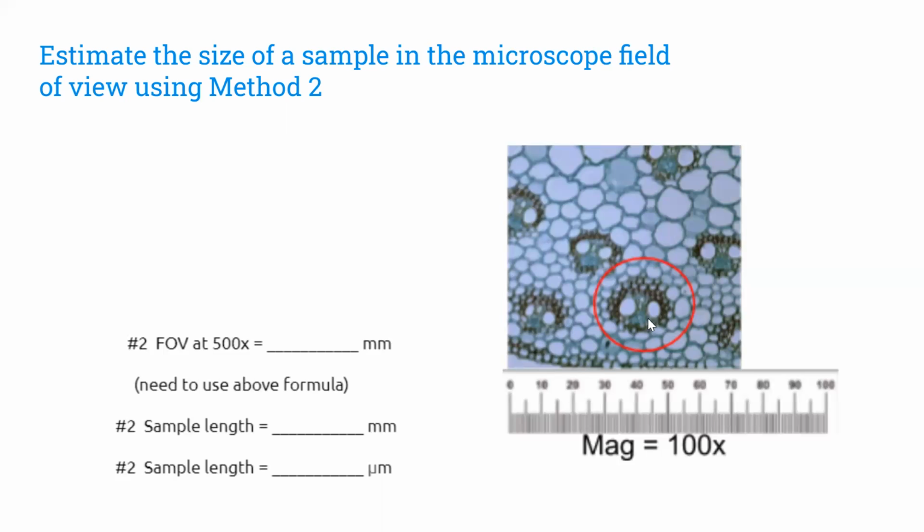Okay. So how many did we get that would fit? What did you guys get? 2.1. So 2.5 red circles. Okay, so we'll do that in red. What did you guys get if you just measured the smaller, the actual clump of cells? I'll do that in blue. You said 3? I'd say 3.2. Okay, I can't really draw, but there would at least be like 1, 2, 3. 3.3, 3.4. I might even say 4, almost 4 maybe.